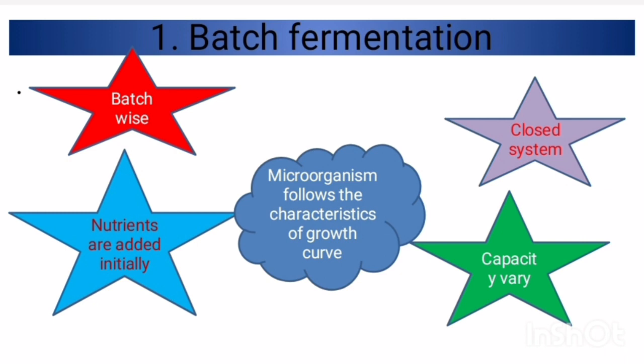In the case of pilot plant, 25 to 100 gallons to 2000 gallons. In the case of large fermenter, 5000 to 10,000 gallons.